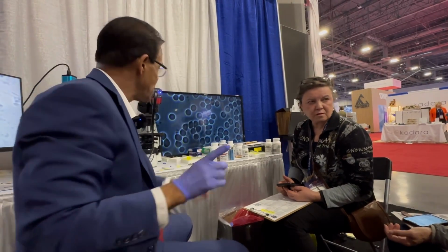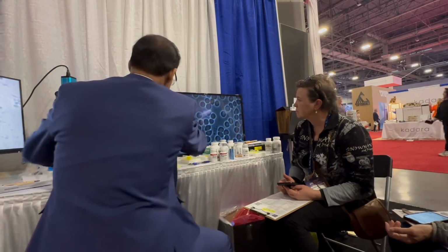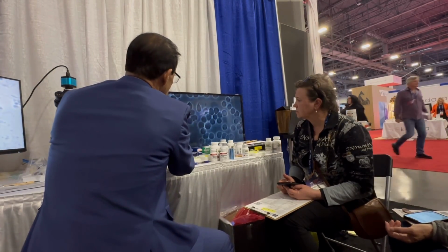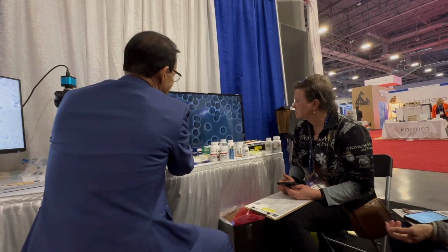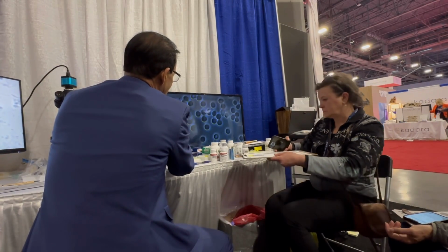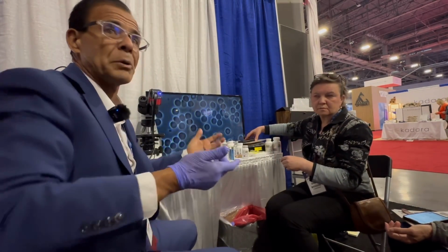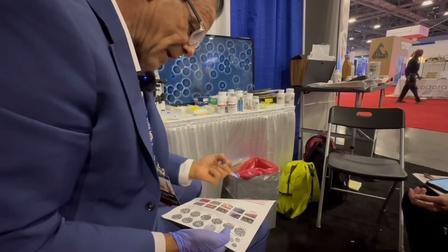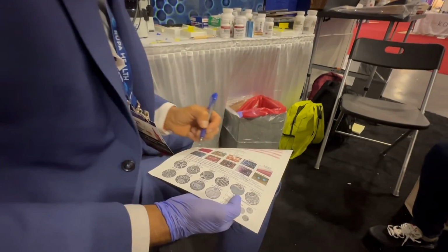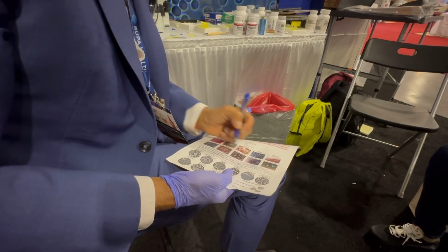Okay, so Monica's blood, she has really well-shaped cells. Now these two are just squeezed amongst each other. They're fine. Because look, the rest of them, wouldn't you agree? Except for the teardrops, but that's just an artifact of too much fat sticking to the cell, right? Aren't they pretty much round and uniform? You agree, right? Nearly perfect. Her blood, based on her meal, that's temporary. That can be corrected. In terms of the shape and morphology, it's excellent.